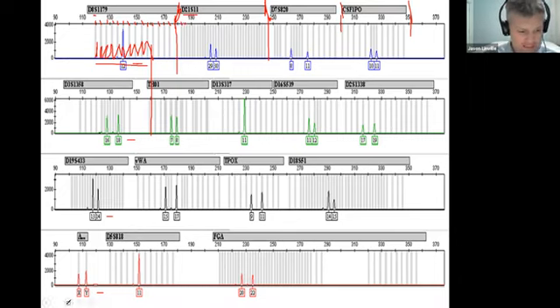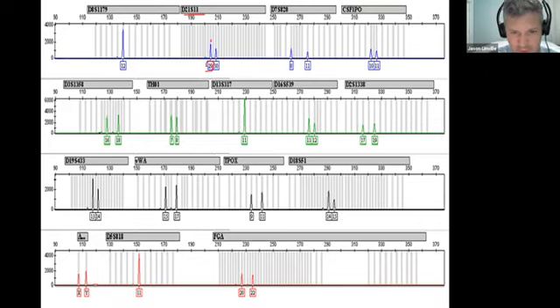Let's go ahead and erase this. Because, let's look at D21 here. Because this peak here is coming out in this gray bar, it knows, oh, that's a 29 allele. Because you just ran a ladder a couple samples before this that had a 29 peak from D21 in it. And this is where it came out. It came out exactly at 204. Okay.